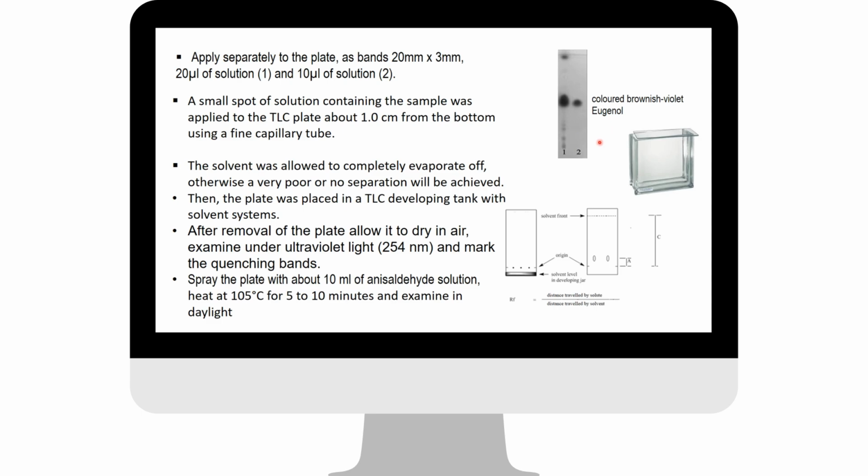In case of TLC, since the silica gel is polar in nature, once we run the sample on the silica gel, the polar constituent can adsorb first, and the non-polar will go far away from this. So in this way the separation takes place, and it depends on the solubility of the constituent in the mobile phase, right? And the separation of these constituents can happen on the TLC plate. So this is the principle of TLC, and this way we can have different spots.